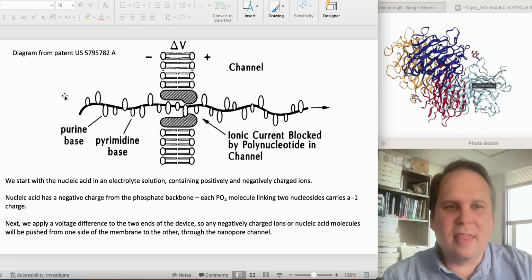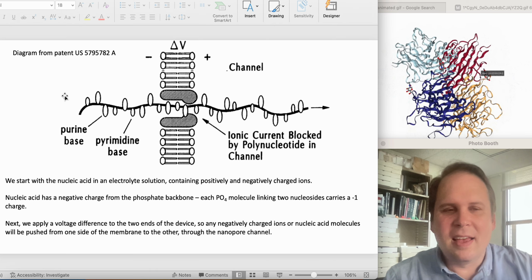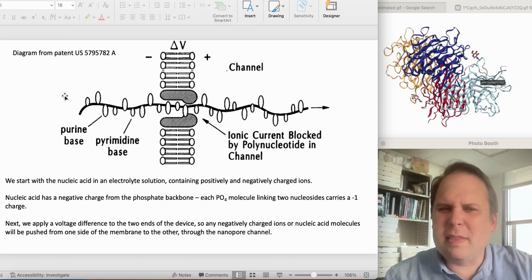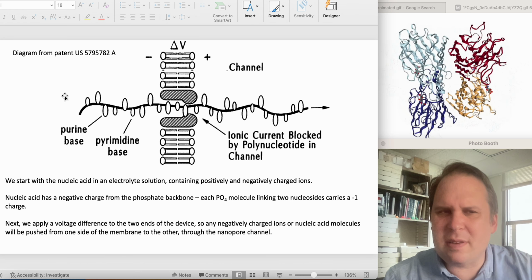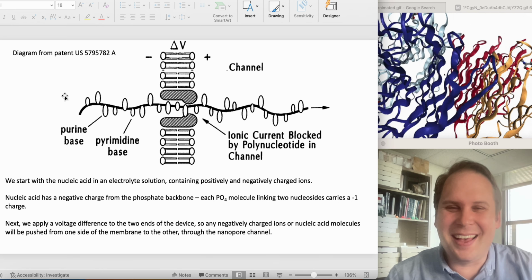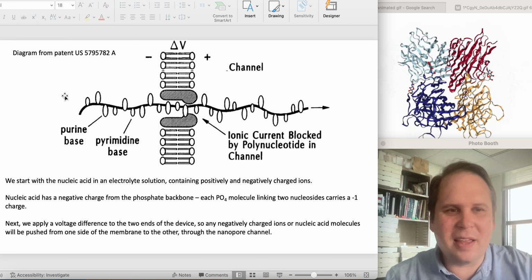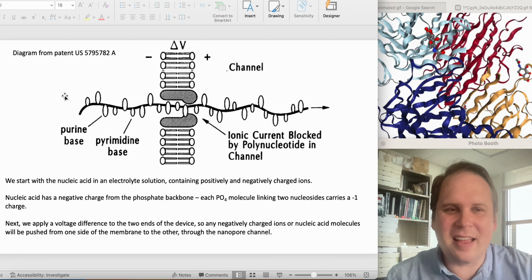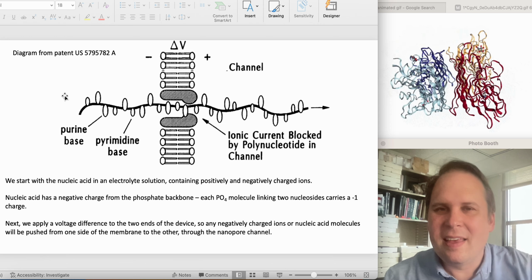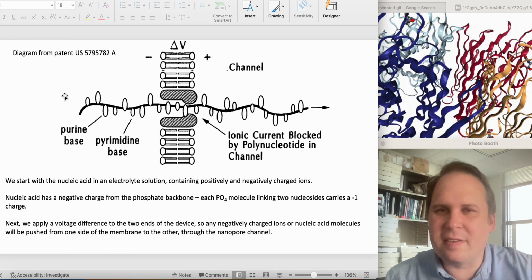Okay, then, you're like, I'm feeding this through the hole. How do I actually tell? And you tell with voltage differences. You're like, but the nucleotides don't really have particularly different charges. And you're right. They don't really have charge at all. There's a -1 on the phosphate backbone. And other than that, the side chains have a little dipole moment, but they're not charged properly. They're just like an uneven distribution of a neutral charge.